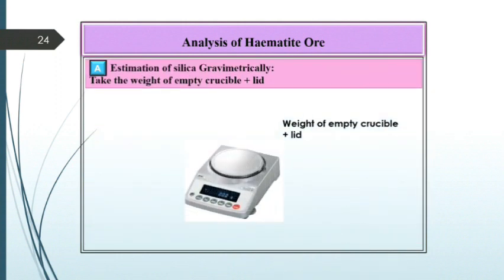For that, take the weight of empty crucible plus lid on a weighing balance. Record this as W1.